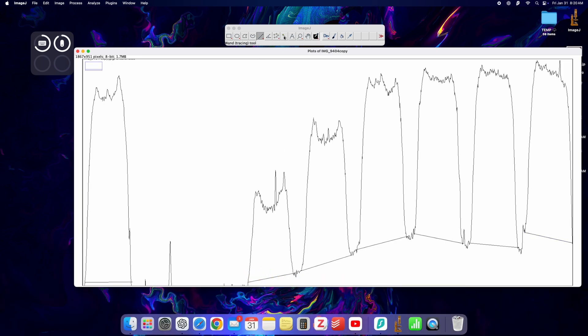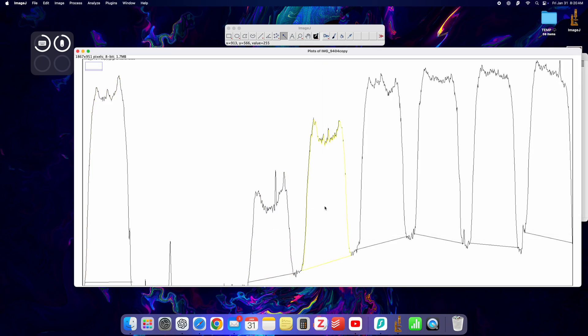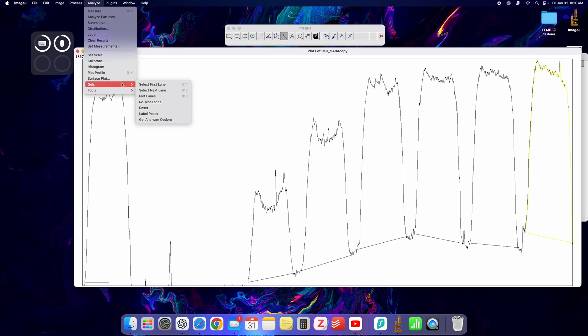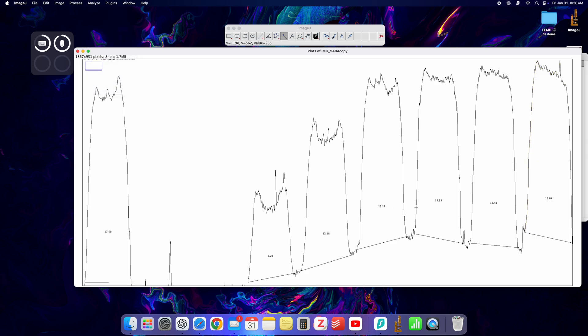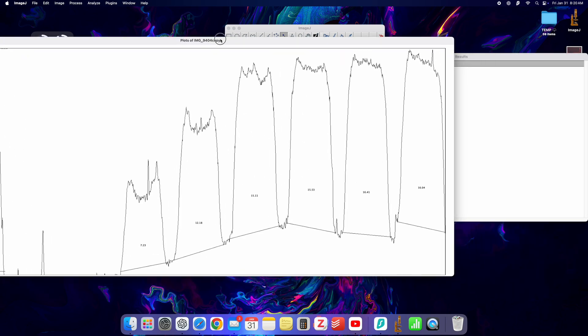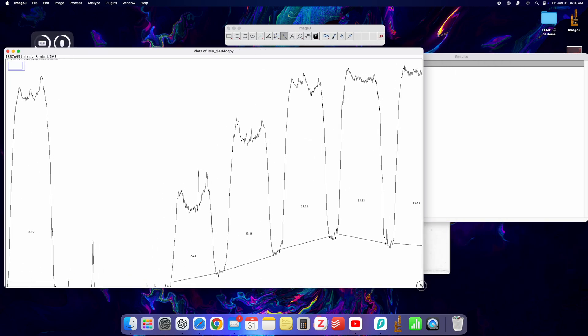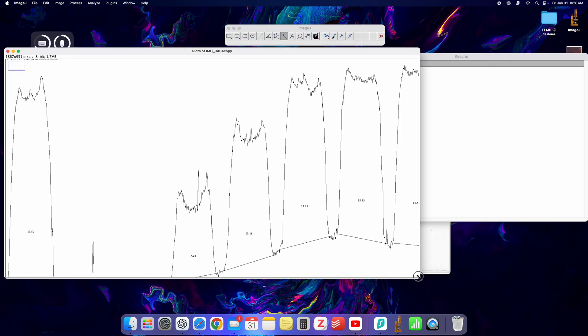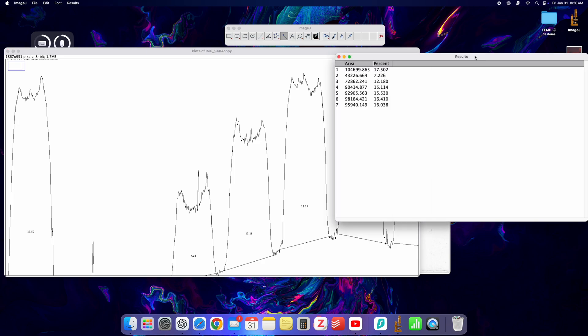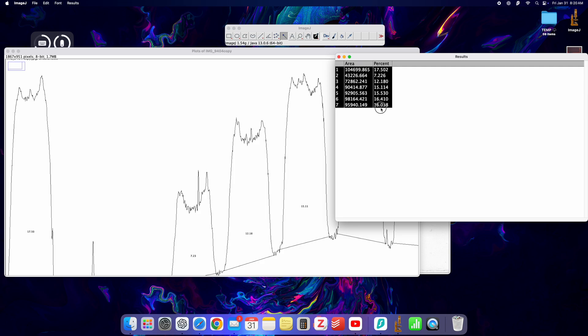Then I'm going to select the wand tool and select each peak individually. What I can also do then is basically go to gels and label peaks. So this will give me a percentage of the total surface area basically, and these will be my results. Of course what I can do right now is just copy it into an Excel or something similar and I can analyze this data right here.